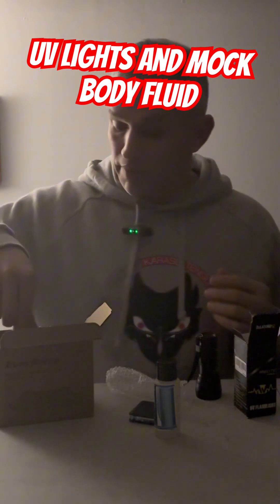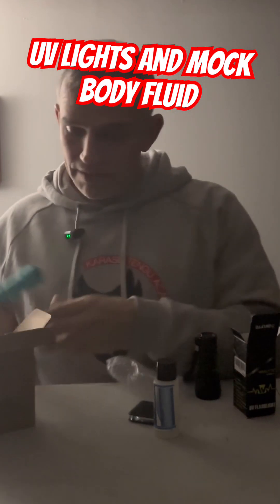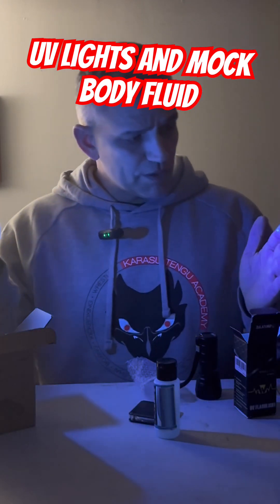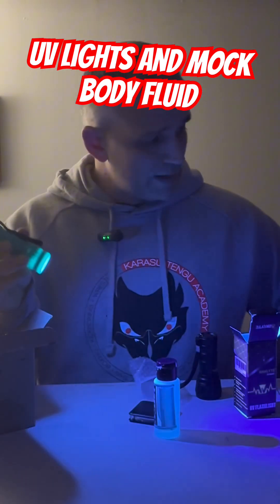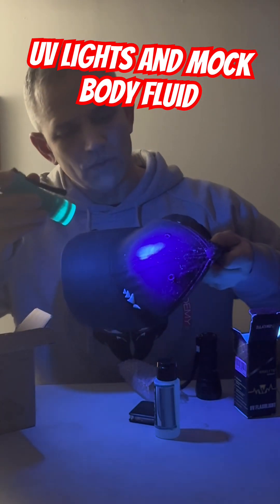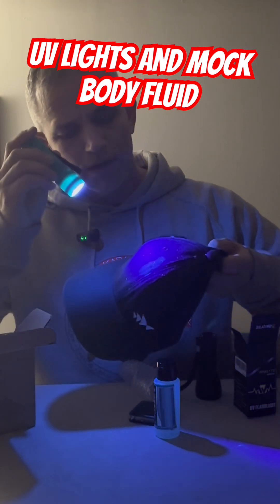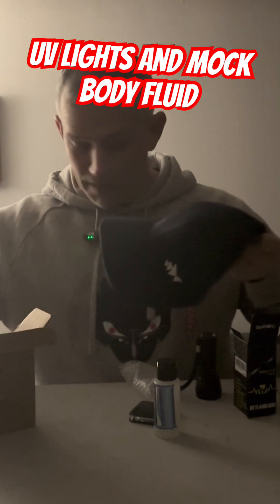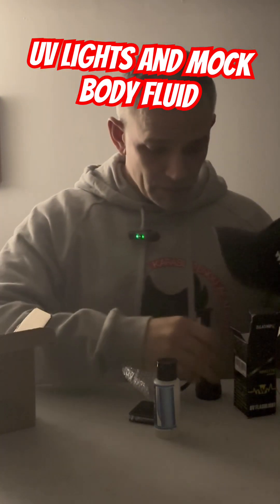I'm going to start with the nine LED — these are the ones with the six in the box. Look how bright these are, these are pretty good. You can see I have some of the ink on my hands, but this is how good that ink works. Look at that stain. So if you wanted to mimic stains, that works really, really great. And again, these are pretty inexpensive but they work really well.